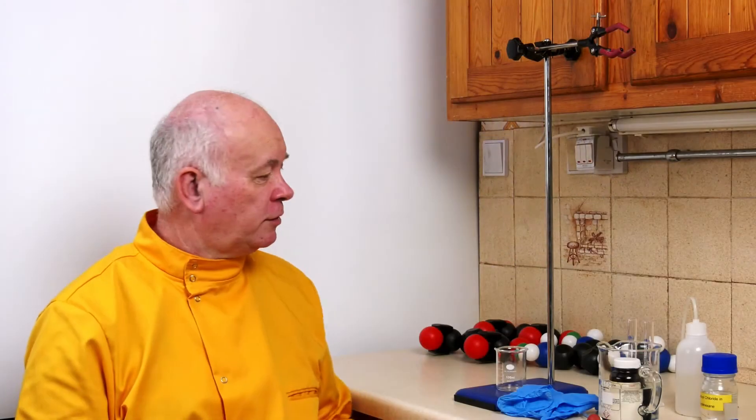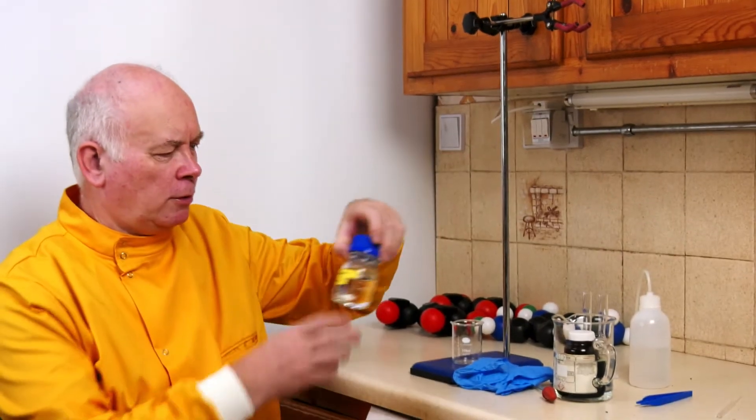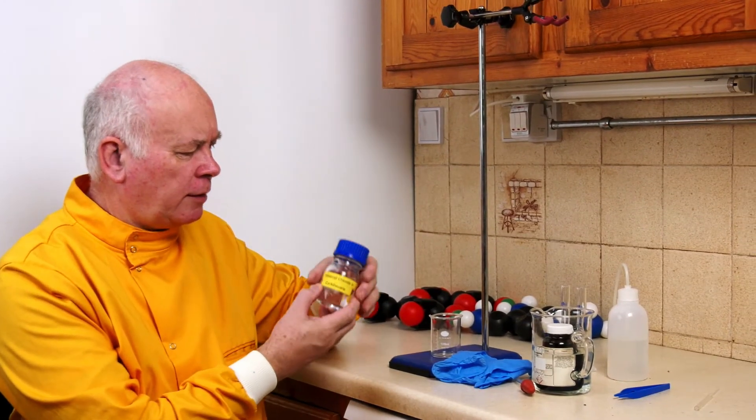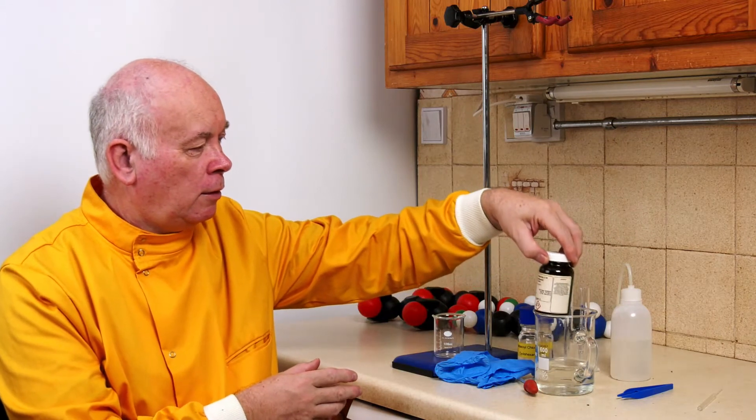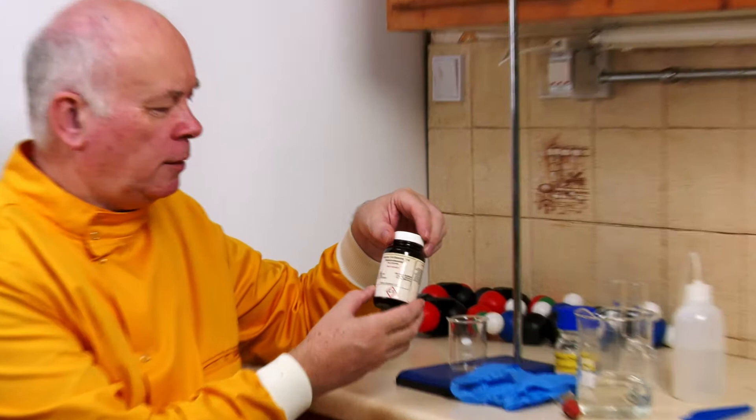So this is the nylon rope trick. We've got a couple of chemicals. We've got this stuff which is sebacoyl chloride in cyclohexane. It's oil based so this will float on this stuff which is hexane 1,6-diamine.